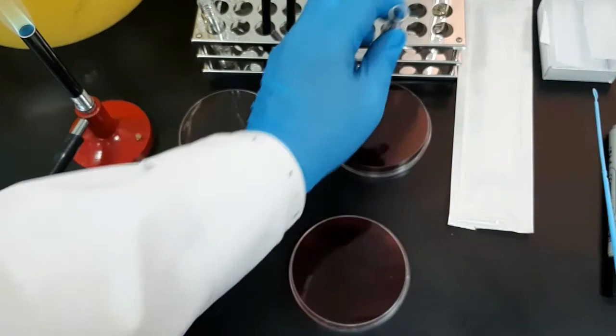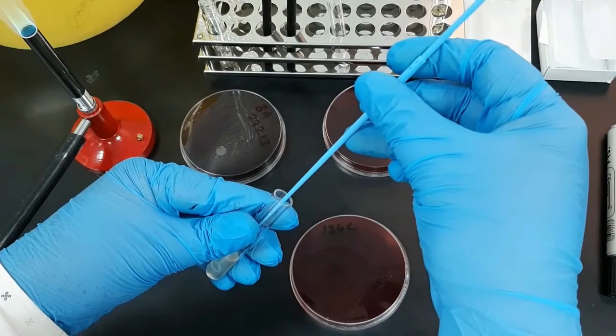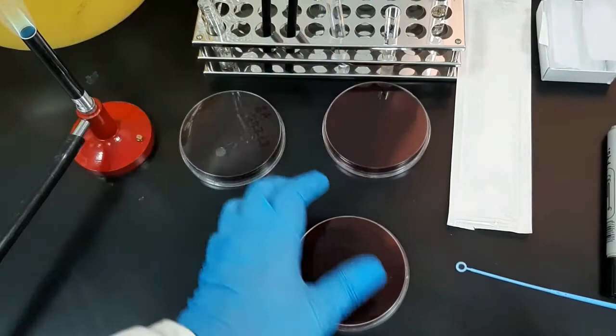Then dip the loop into the liquid bacterial suspension and transfer it into the fresh labeled plate by spreading over the first quadrant area using close parallel streaks in a zigzag motion.